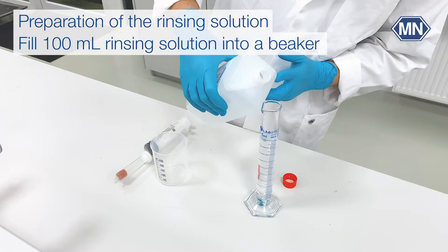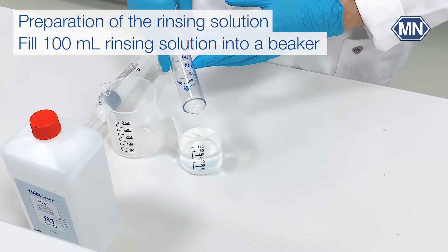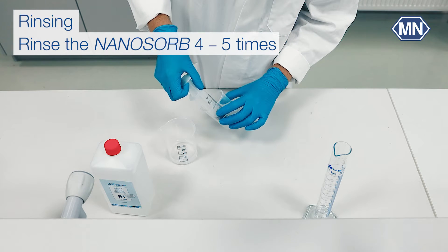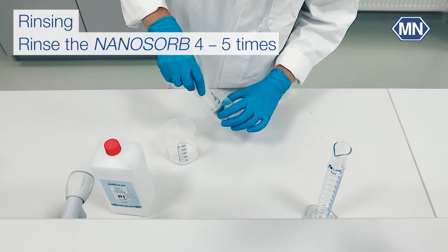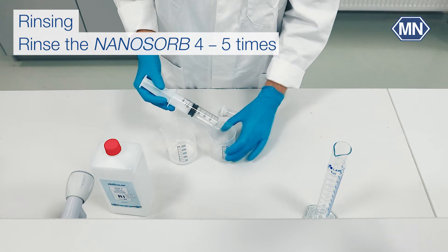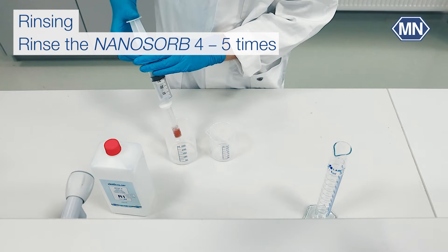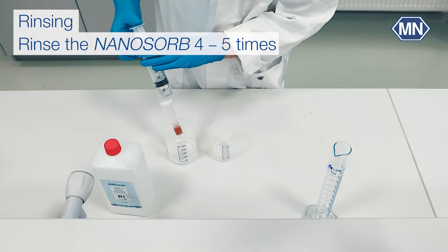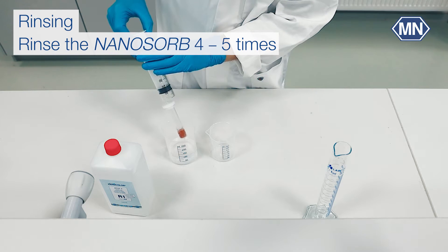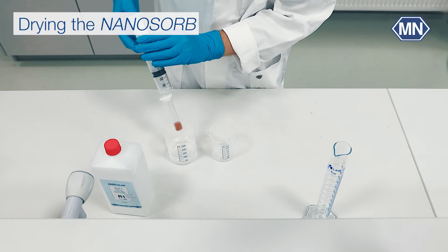Pour 100 ml of the rinsing solution into a beaker and remove the syringe from the cartridge. Fill the syringe and connect it to the cartridge. Rinse the nanosorb and collect the waste solution in another beaker. Repeat this process 4 to 5 times until the volume of 100 ml is consumed. Blow the nanosorb dry rigorously.